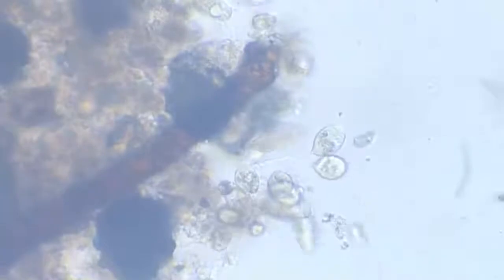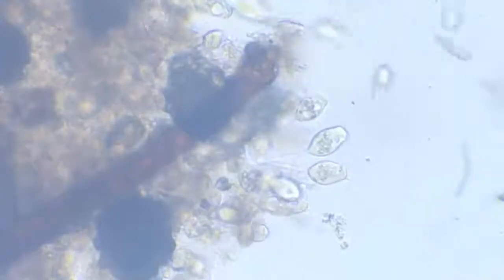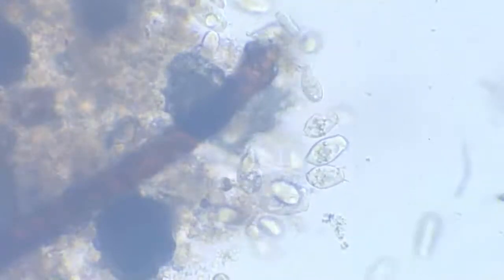All right, so now let's try to find some amoeba in here. They are a little tricky because they are so small, but I'm sure we'll find some here.